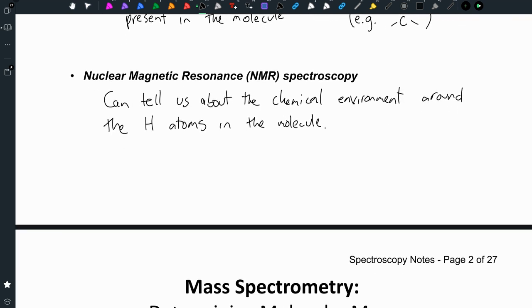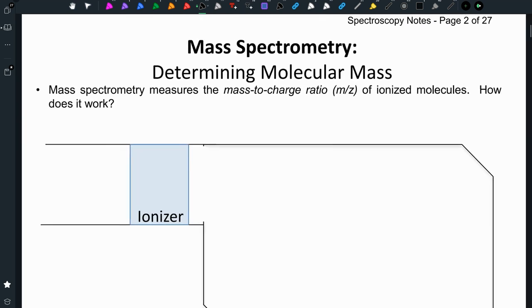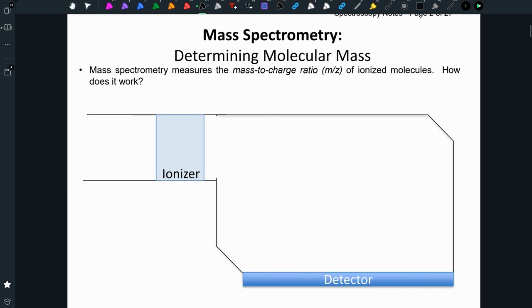All right. I'm going to start with mass spectrometry. It's in some ways the simplest, and it's not one that I would ask you to actually learn all the ins and outs of. But I think it's helpful to have some background on how it works, because just to say, oh, it tells us the chemical formula without giving you any idea of how it does that isn't necessarily the way I roll. I like to give you at least some basis for understanding it.